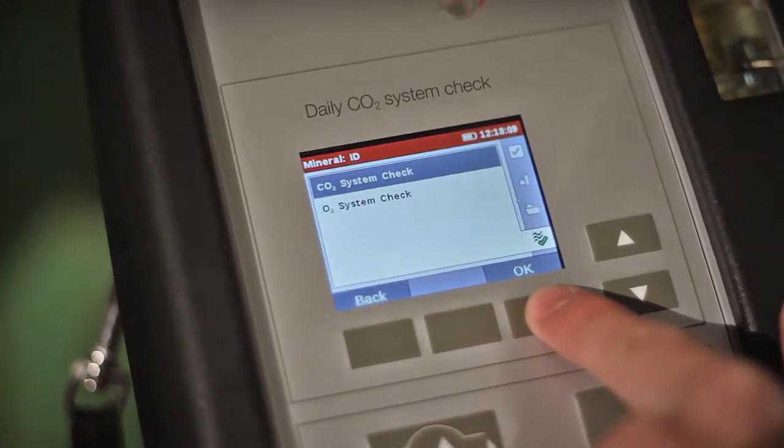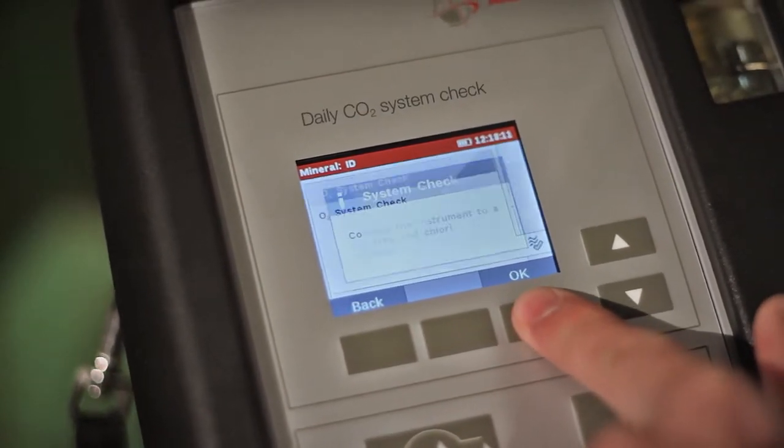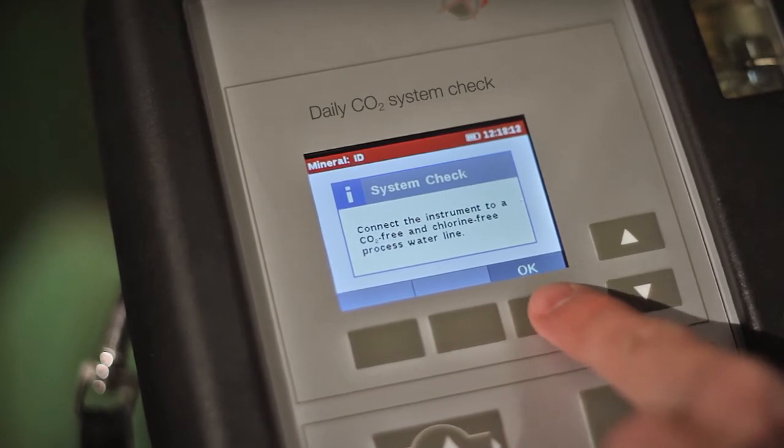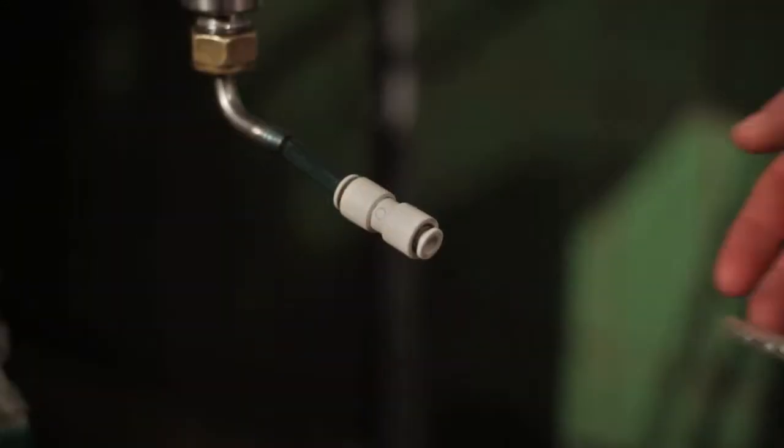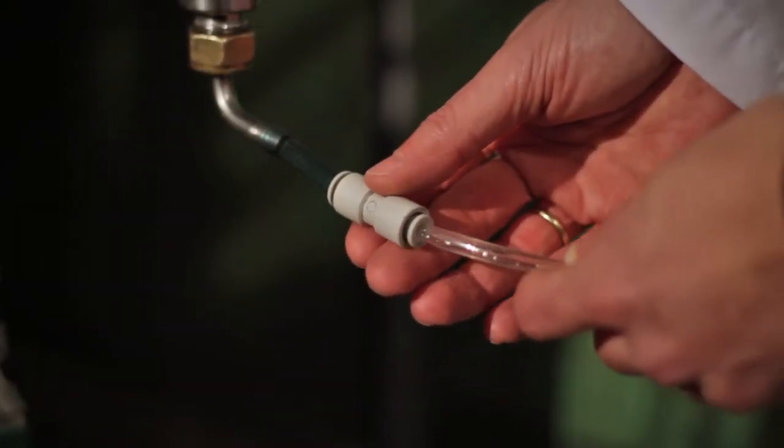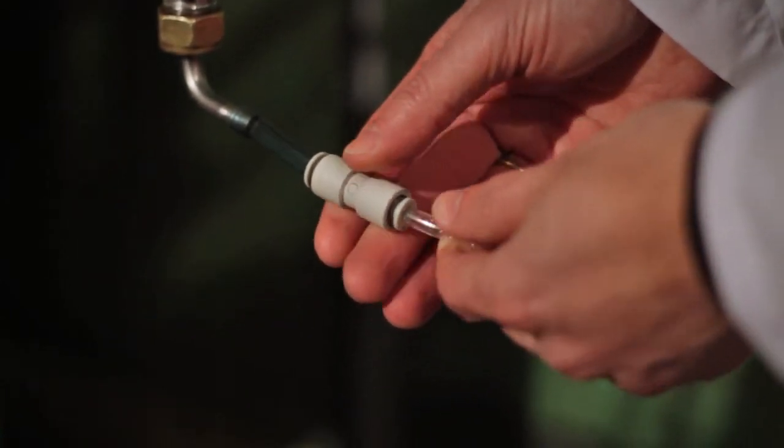The implemented CO2 system check is recommended daily before you start the first measurement procedure. Connect the instrument to the water line and use CO2-free process water.